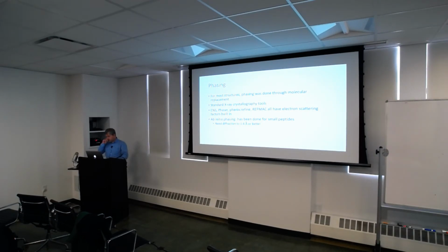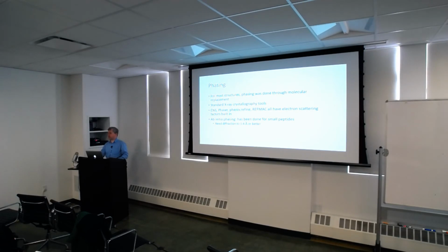Wait, so why not just take an image, like in 2D crystallography? The phases are not going to be accurate. Yeah, we said that was a single layer technique versus many layers, remember? It's not a 2D crystal. It's a 3D crystal, and you have to figure out which spot is which in the diffraction pattern. And I think they're working on that.